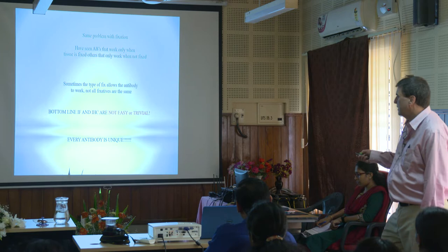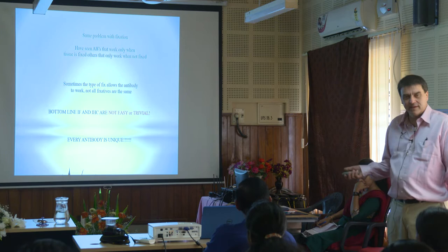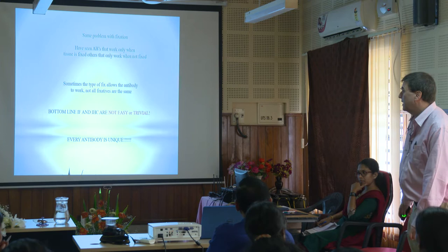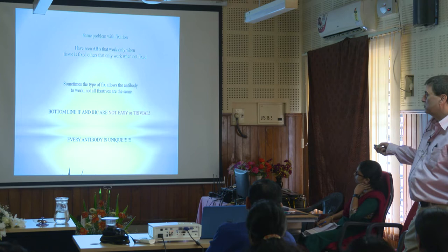And I had trouble with this antibody at first, trying to make it work. And then the one guy in the lab said, well, you can't fix the tissue. You can't fix the cells. I was like, what? Why didn't somebody tell me that when I started? I mean, you know, I just assumed. I made the mistake of assumption. So on that particular antibody, it only worked when the cells were not fixed.